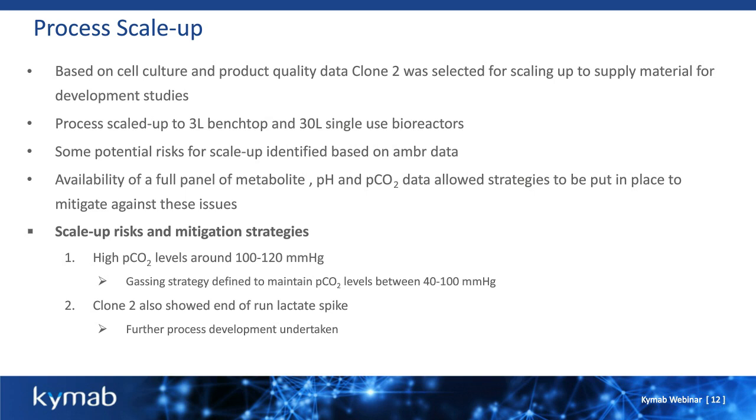Some potential risks for scale-up were identified based on the ambr data, and the availability of the full panel of metabolites, pH, and PCO2 data from the FLEX2 during the RCB screen allowed for strategies to be put in place to mitigate against some of these issues. So I'm going to talk about a couple of the scale-up risks and the mitigation strategies that were put in place.